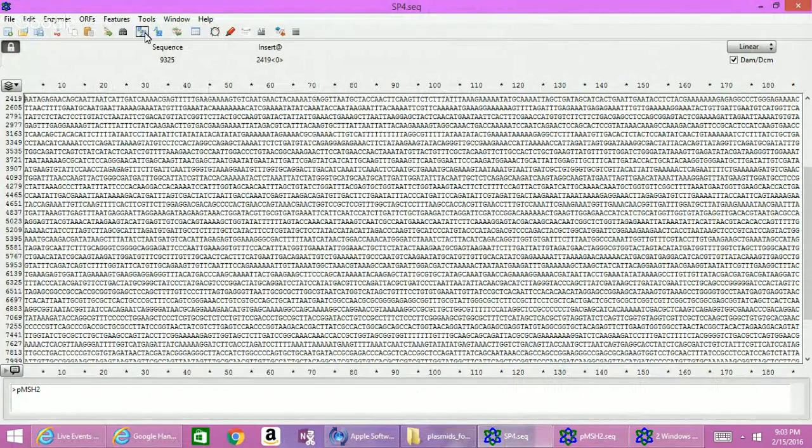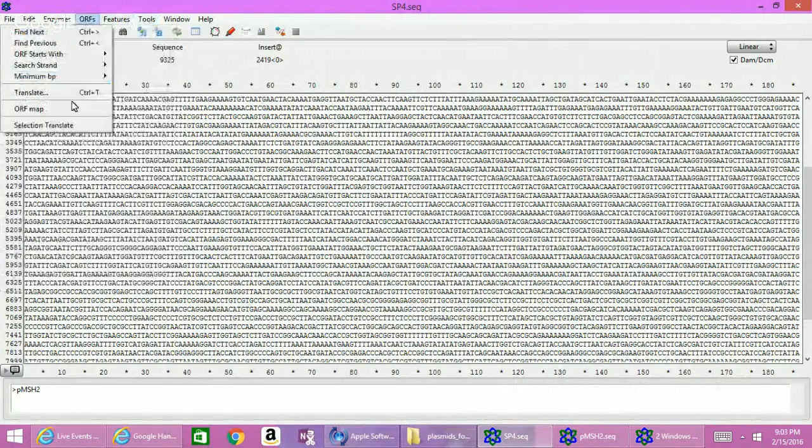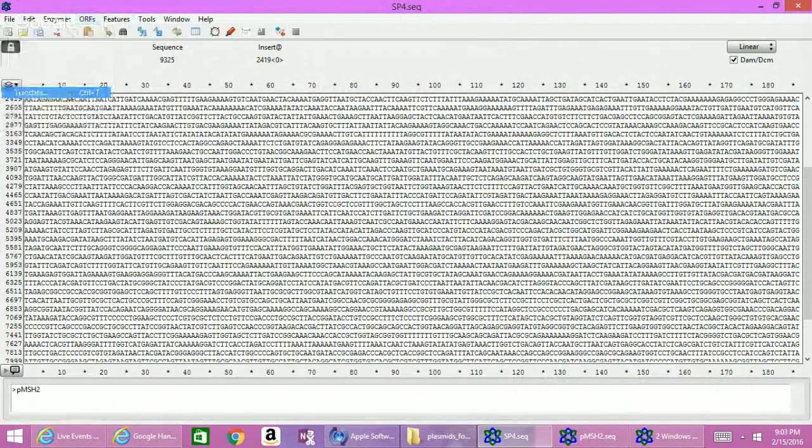So I'm just going to translate both of my two genes into their protein form or amino acid form.